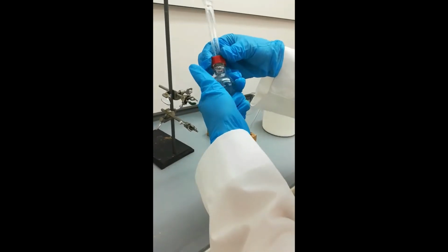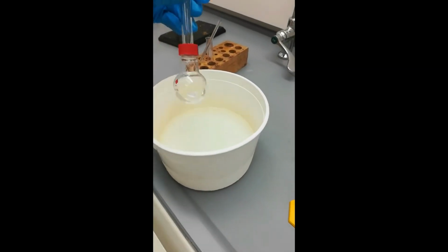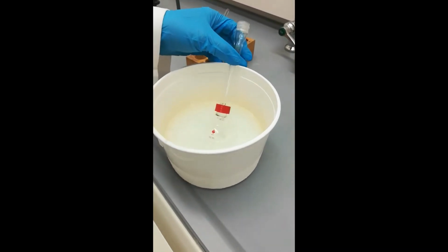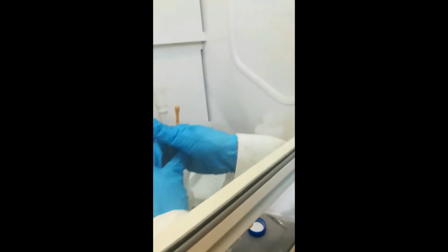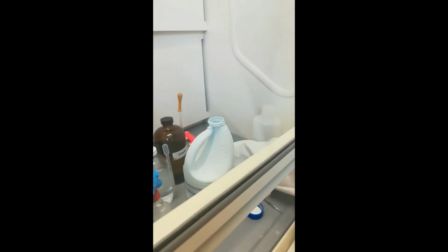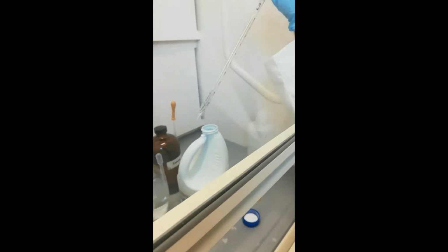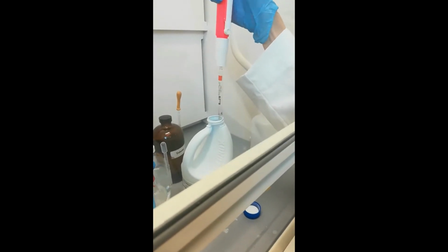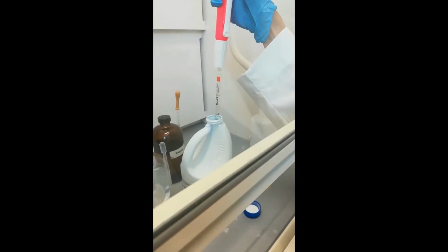Attach an air condenser on the round bottom flask and place the flask in an ice water bath so that the solution cools down to about 0 degrees Celsius. Then we pipette out 9.2 ml of Clorox bleach and quickly add it to our solution in the round bottom flask.